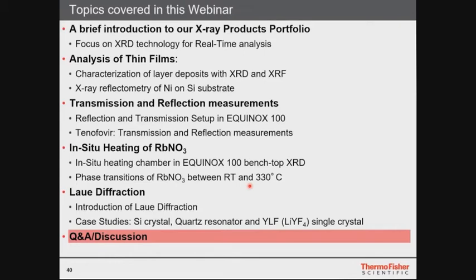So as far as I know, there are some norms which apply for asbestos in the cosmetic industry. I'm not very familiar with these norms, but in principle, asbestos is a crystalline material, so it's a silicate, and it will give some signals, which then could be quantified.